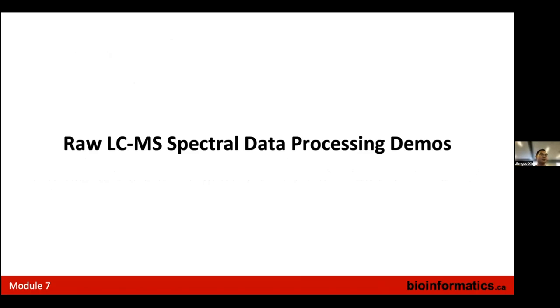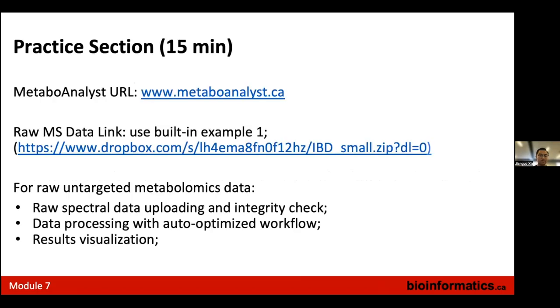This next section is mainly designed for untargeted global metabolomics. We are going to use the MetaboAnalyst website and go to the built-in example. You don't need to download it — you can use the link directly beside the option. For raw untargeted metabolomics data, we are going to demo raw spectral data uploading, integrity checking, data processing with the auto-optimized workflow, and some result visualization.